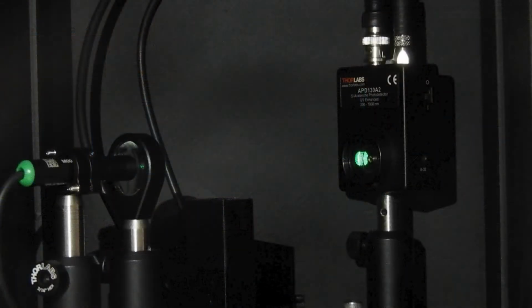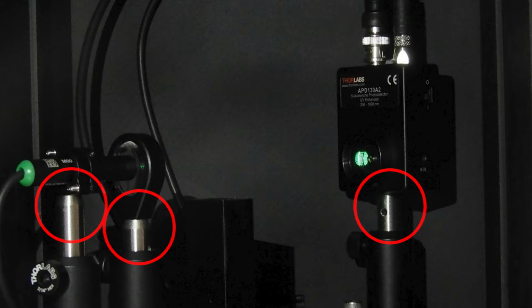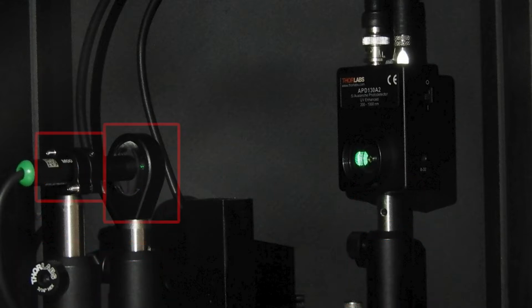The four main optical components are held within a rigid assembly using 3 optical posts and pedestal holders, lens and kinematic mounts, and a 3D printed cuvette holder fixed with through holes and a pedestal to provide the ability to accurately adjust the system to the necessary distance and height requirements.